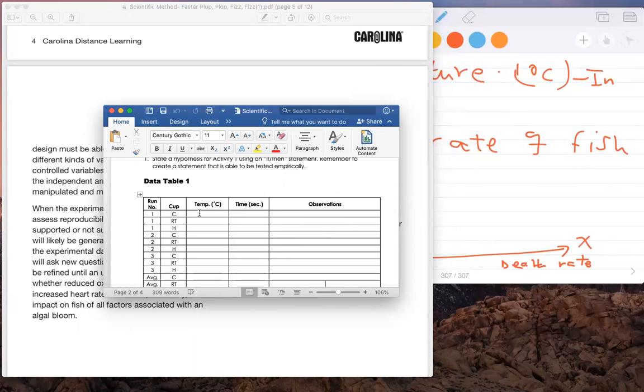I will measure now only the H2O with no ice in there. I don't want you to carry out the experiment with ice in there. It's just ice cold water. You can see ice, you pour the water. This will be your cold run.